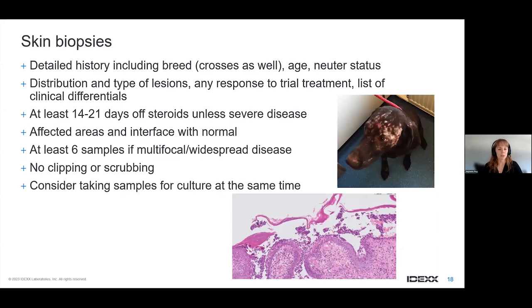Okay, so I would like to talk a bit about the more challenging samples or more challenging surgical approaches that we see from time to time. We get a lot of questions about skin biopsies, especially how many skin biopsies, which sizes, and so on. So that will be a bigger topic of today's presentation.